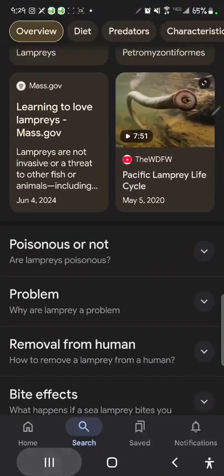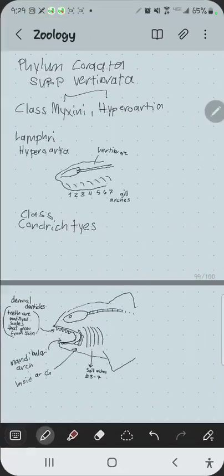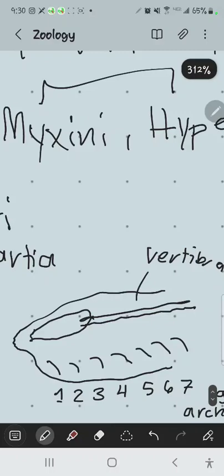I won't have this on a test because it's so delicate. I can't really put labels on it. So on the test, you'll see something different. The best way to compare it would be like this: here is a cranium from a dogfish shark. This is not the jaw that goes with the skull, so the jaws are kind of small here. But basically, they operate like that. This is a cranium for a shark, and this is a jaw for a shark, not the same shark. But that's how they roll, like this.